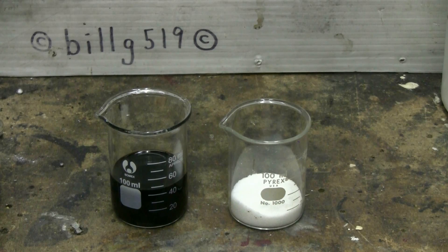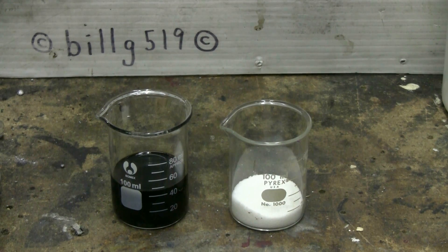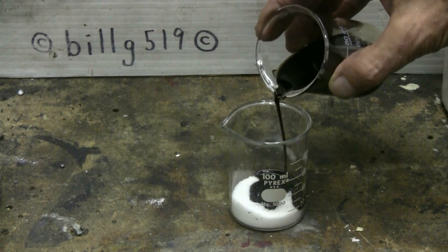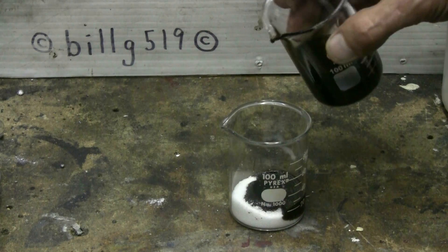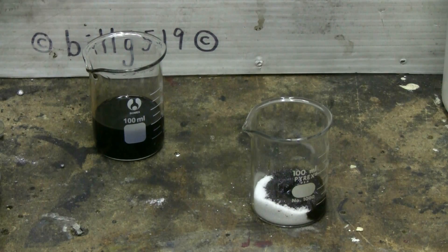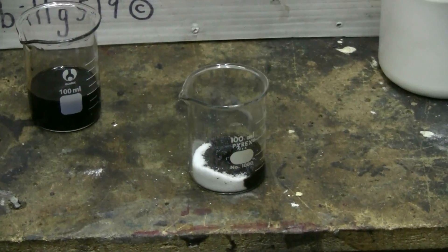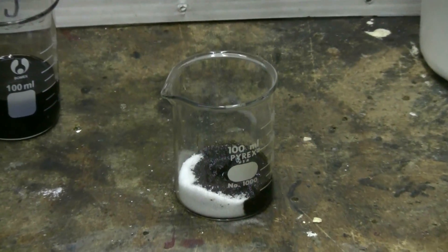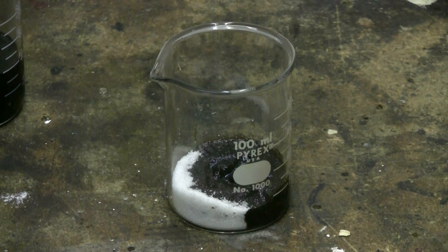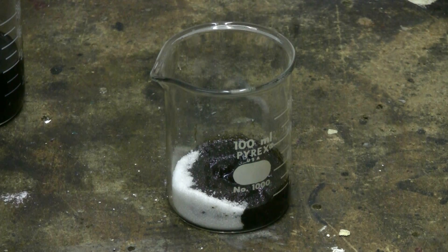The drain cleaner sulfuric acid is in the beaker on the left. I dumped about 50 milliliters out of the bottle. I'm going to put some into the sugar, and we'll see what, if anything, happens. This reaction can take a few minutes to start, so I'll just leave the camera on it and we'll see what happens.